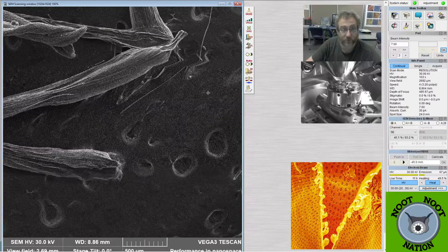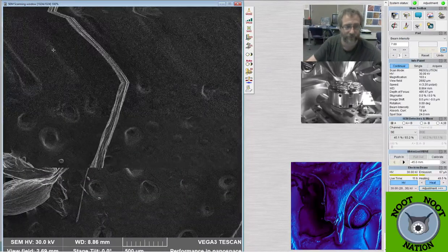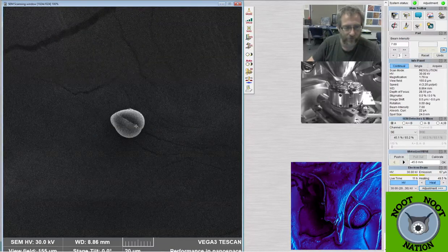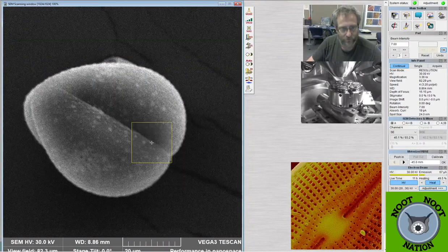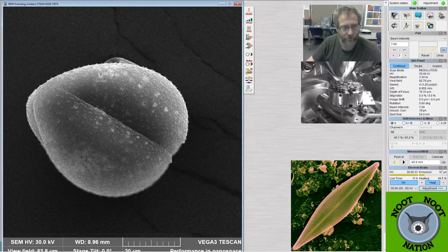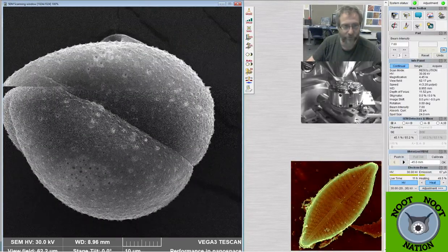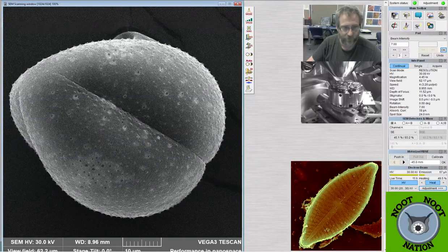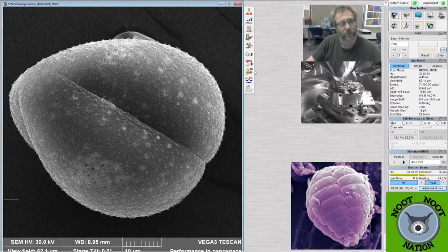These plants closed up when I brought them in. They were closed, and I think just being inside at room temperature caused them to open up a little bit. So let's see what this one is. Yeah, so I think this is a side view of one of them. And you can see they're a little bit more oblong shaped. But they're like giant beach balls compared to some of those other things we were looking at. A bunch of little holes on the surface. That's cool. I'm a big fan of things with little holes in them, so. This will be good. I might have to adjust the brightness a little bit.